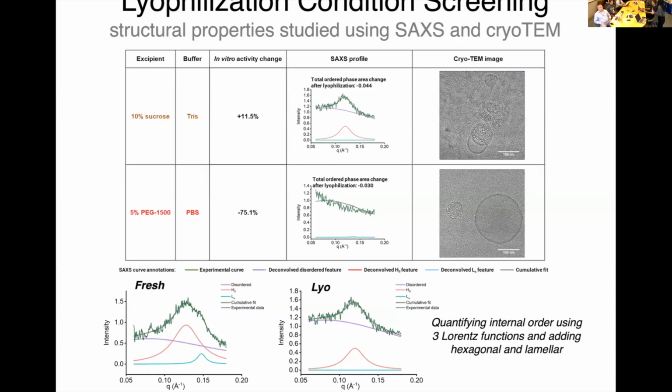Right. Oh, sorry. With the microfluidics, how much change is there if you alter the velocity through the channels? Wait, so your question is how much change? For your nanolipids that come out, say you introduce it at just a high rate, high pressure. I guess, how does flow rate affect structure?